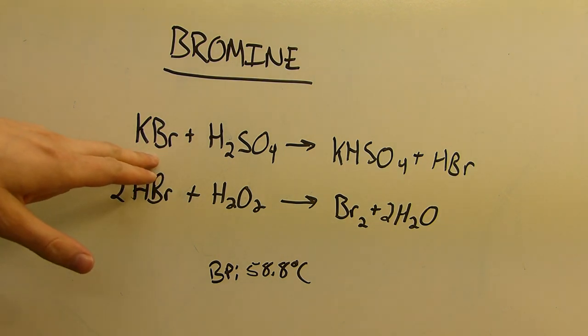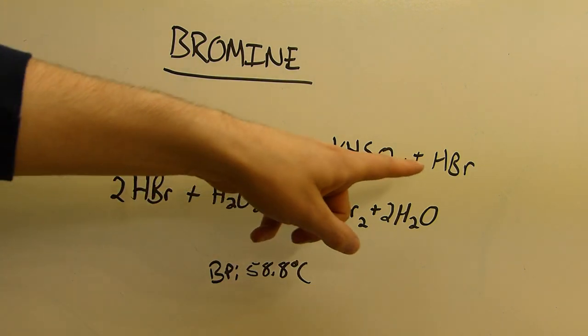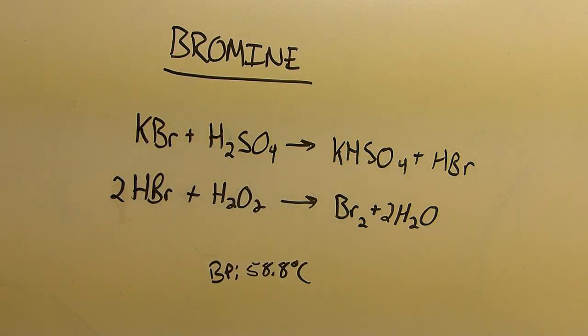The bromide ion is easily oxidized, so by adding an oxidizing agent to a solution of bromide it's pretty easy to free elemental bromine. We'll add sulfuric acid first to potassium bromide which will yield mostly potassium bisulfate and hydrobromic acid. The sulfuric acid will also oxidize some of that bromide into bromine. Then to boost that oxidation we'll add hydrogen peroxide, which will oxidize the hydrobromic acid into bromine and water. That's a very convenient reaction for isolating bromine and then we can simply distill the bromine off at 58.8 celsius.